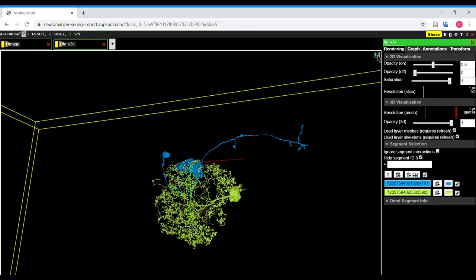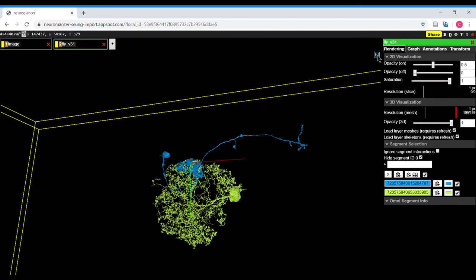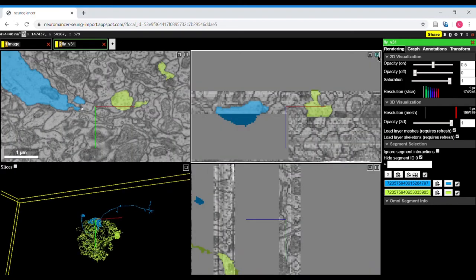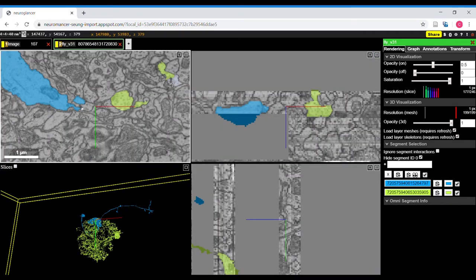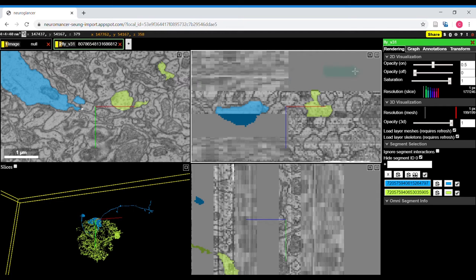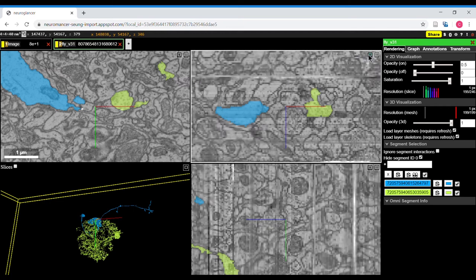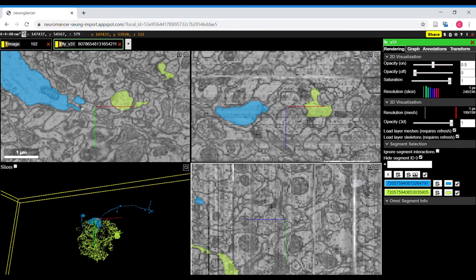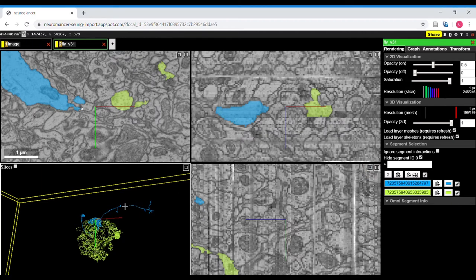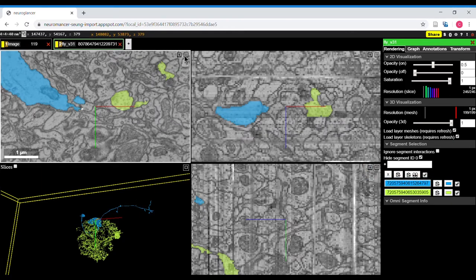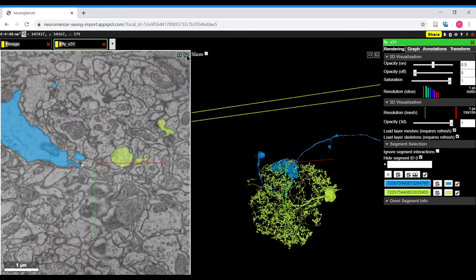This is going to take me right now to the four panel layout which shows an XY view, an XZ layout, and a YZ layout, and the 3D again. And this button will take you back to the original XY 3D layout.